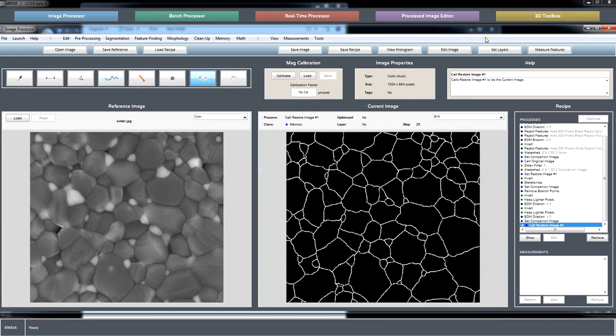I think you had also mentioned that you may have run into a bug or something trying to stack those few slices together, and we're wondering if it was the size of your images. Is that the case? Okay. I would still expect that batch to complete. I guess if you still run into that issue, contact me and send your log file or something, and we'll make sure you're not running into a bug.